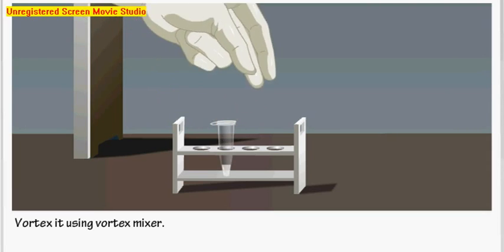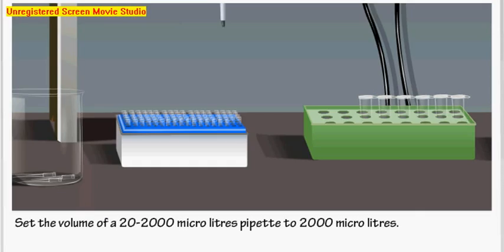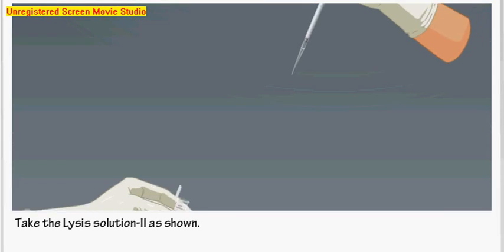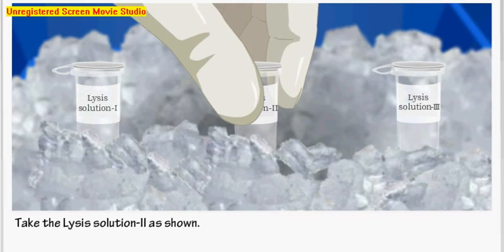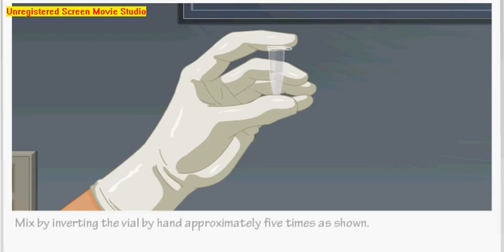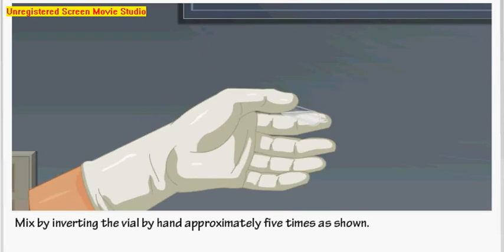Set the volume to 200 microliters. Take an appropriate tip and take Lysis Solution 2. Add Solution 2 to the vial containing the pellet and Lysis Solution 1. Mix by inverting the vial by hand approximately 5 to 6 times. Then put the vial in the ice box for 1 minute.